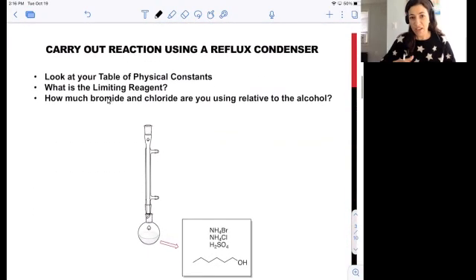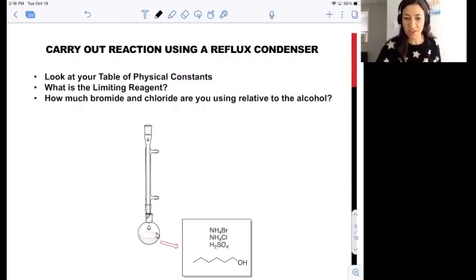Practically in the lab, in order to get this reaction to go, we're going to supply some heat. As we saw in the resolution of ibuprofen, when we heat organic mixtures, we tend to use a reflux condenser attached to our round bottom flask. And we'll use the same setup here with a variac controller and a heating mantle as we did in the ibuprofen lab.